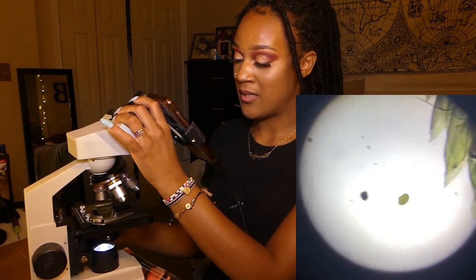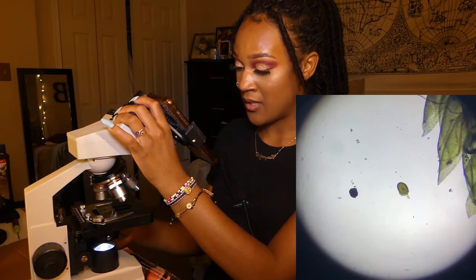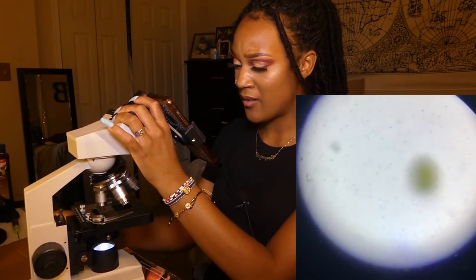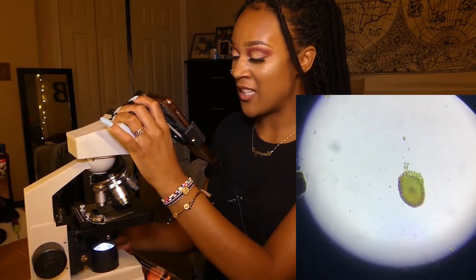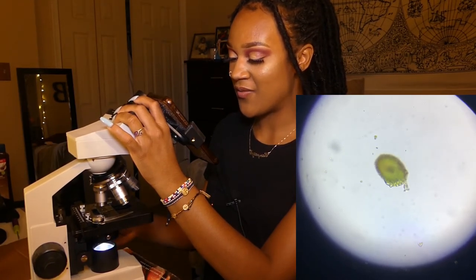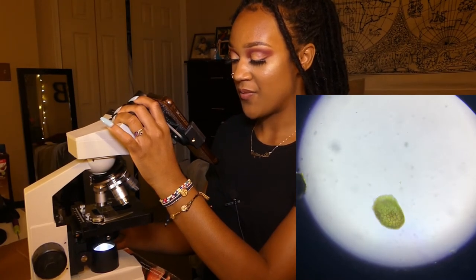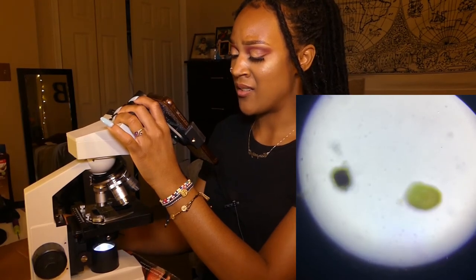Let's see what else we can see. What is that? I don't know what that is. It's just like circling. I think it's a filter feeder too, so it must be a rotifer also, maybe. Wow, look at that. It is a rotifer. Look at it sucking. Look at it filtering the food that's around, and it's just circling and circling. Look at the outside. Look at the structure on the outside. It kind of looks like a snail. Look at it stick out. It's kind of gross.